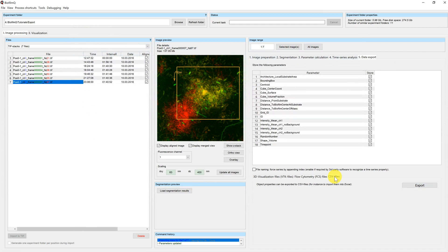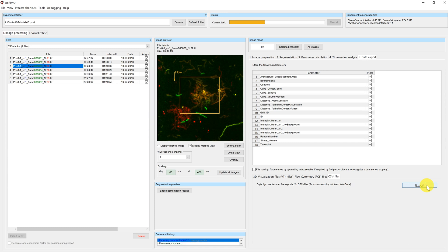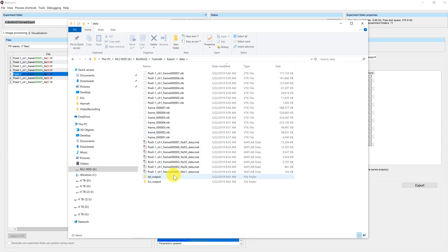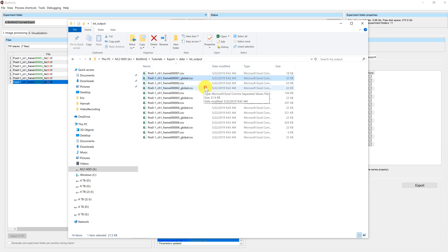The process works the same way for CSV files — just press export and a new output folder will be created. In this case the output folder is called 'txt output,' and you can find two different datasets for every frame number. One dataset contains the per-cube parameters and the next dataset with the 'global' suffix contains the global parameters.